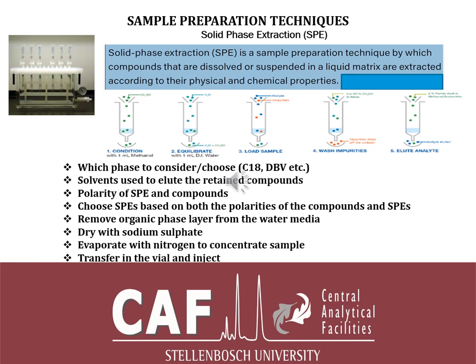or solvent of interest. And then also you can do derivatization on the SPE in terms of thiols and other analysis where the derivatizing agent is added into the aqueous sample, and then it is adsorbed on the SPE, and you elute it. So there's a lot of things that you can use it for. Also bearing in mind the polarity, there are different polarities of the SPEs, so you can also find a lot of information out there from the supplier of this SPE, or one can check on the internet. There's a lot of information about that.